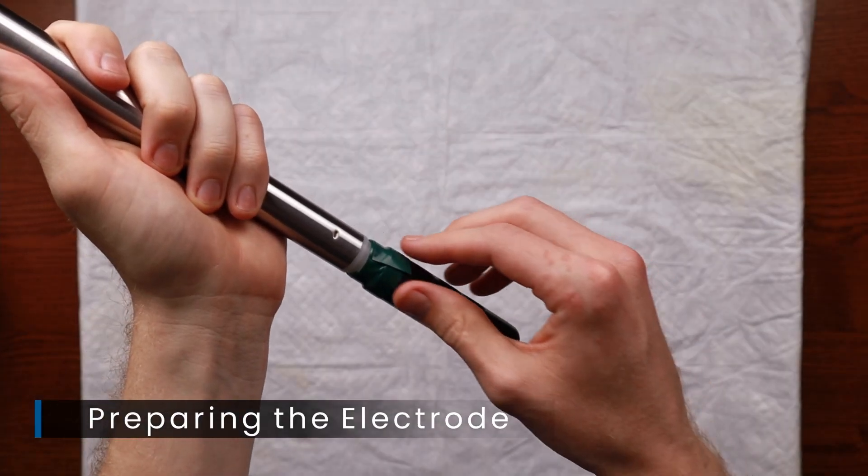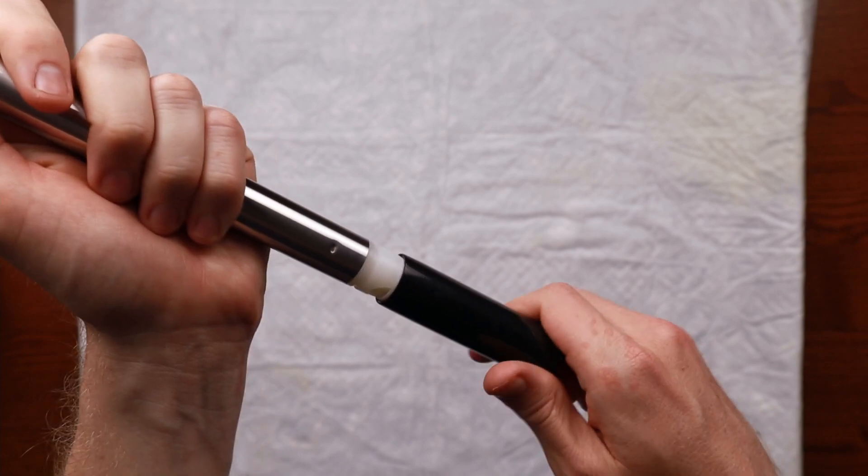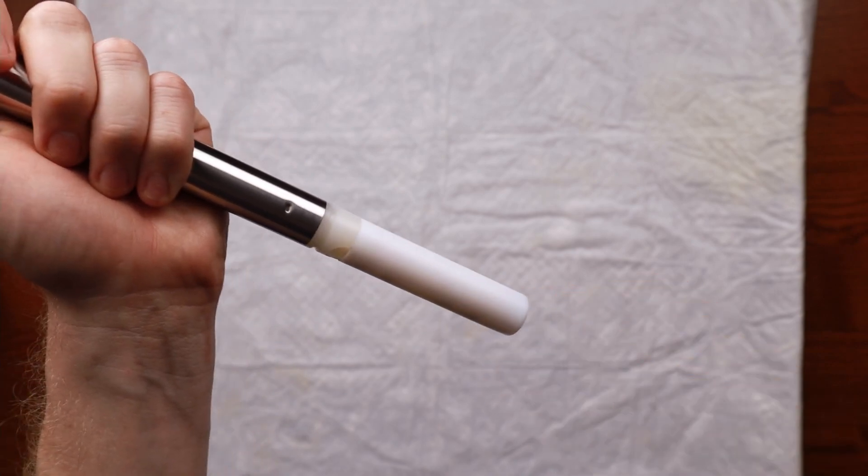For conductivity and dissolved oxygen sensors, simply remove the tape, then remove the boot during use and replace it when storing the sensor.